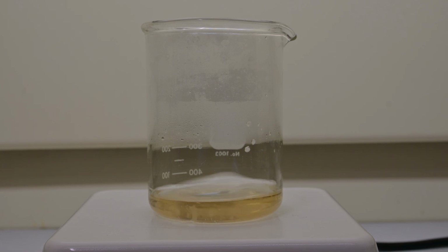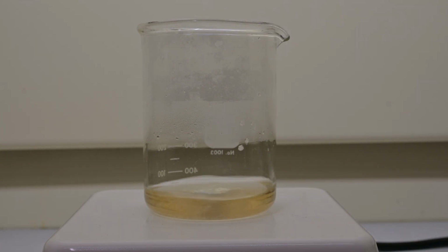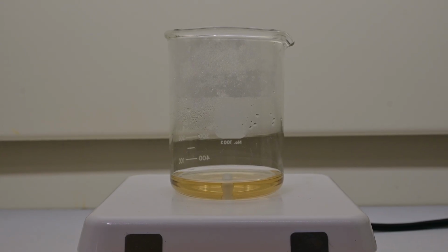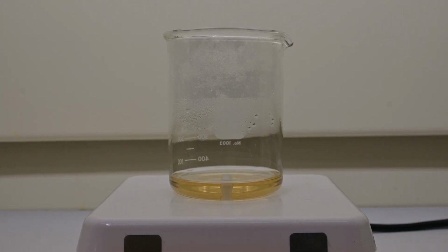Depending on its purity, it may not all dissolve. So if that does happen, the solution needs to be filtered to remove any of the undissolved solids. Due to our due diligence in the last synthesis, we have very pure sulfanilic acid. So this was not a problem for us, and we can proceed to the next step.